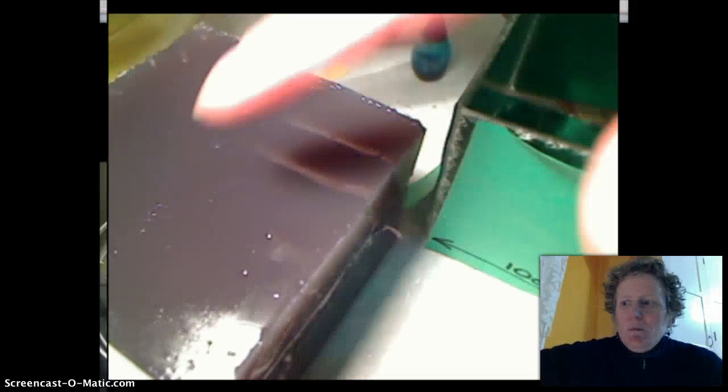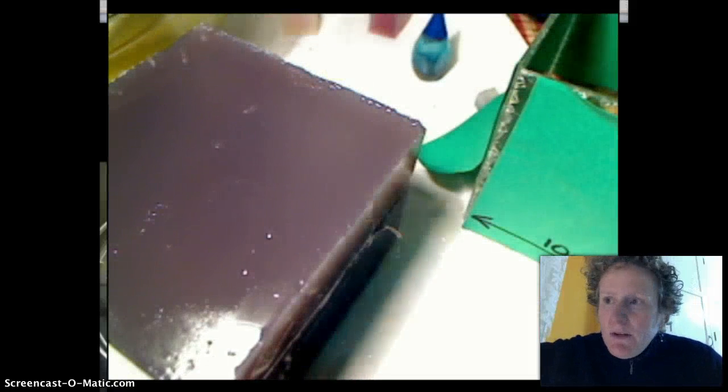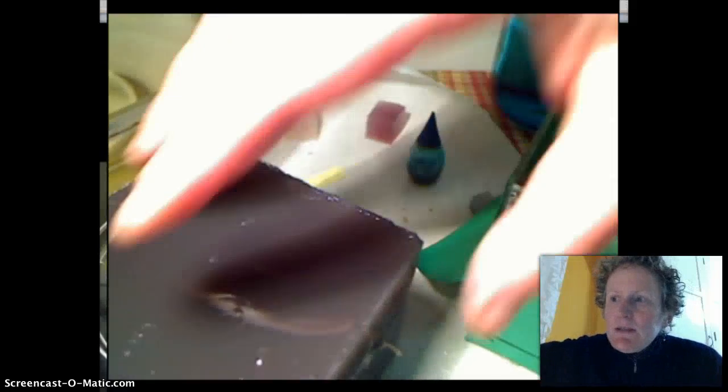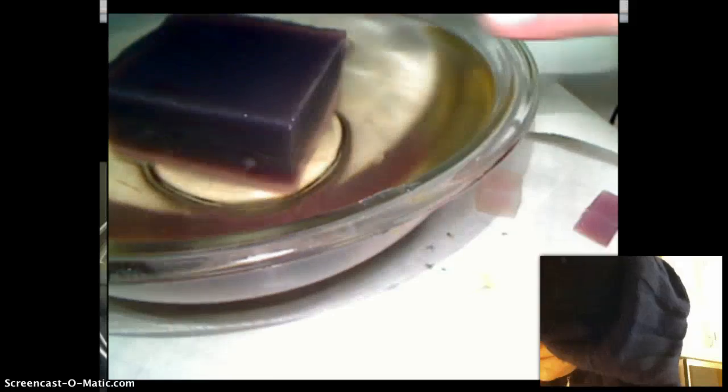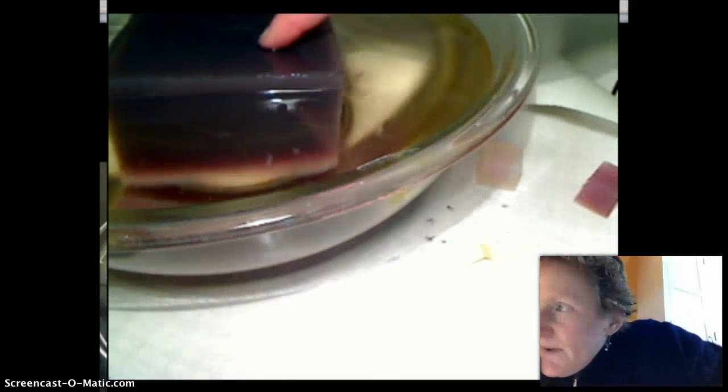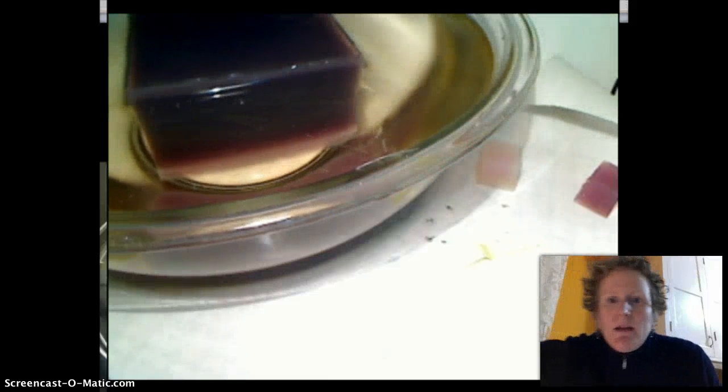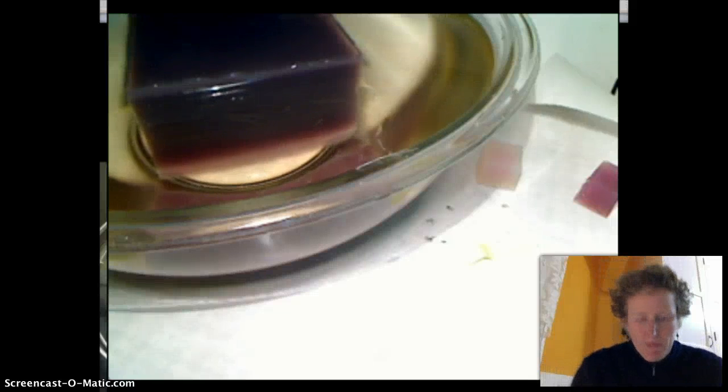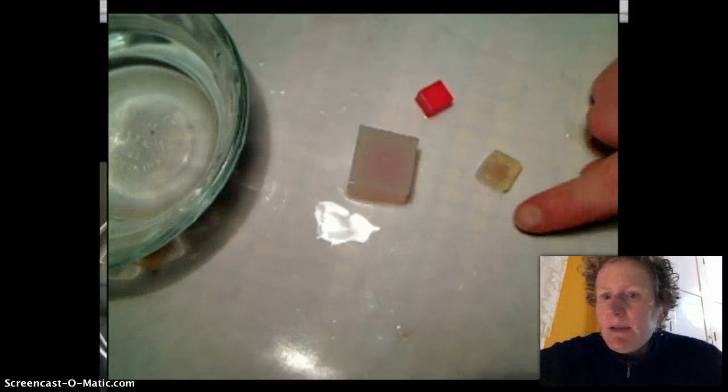Here's a really big cube of agar that is 10 by 10 by 10 centimeters squared. We can put it into a bowl of vinegar here and see how far the vinegar diffuses in just five minutes. I'll slide it into the bowl of vinegar and it can sit there for five minutes. This cube's a little bit purple because it got too much phenolphthalein in but we'll still be able to tell as the vinegar diffuses in and turns it clear.